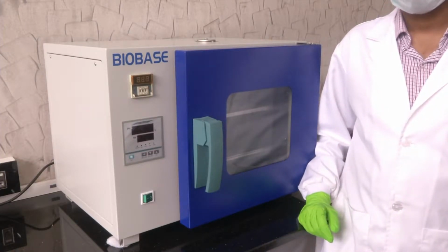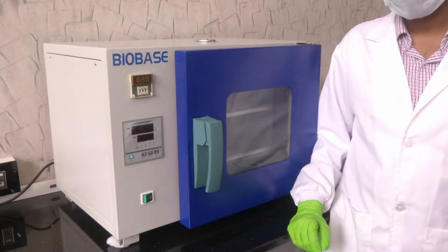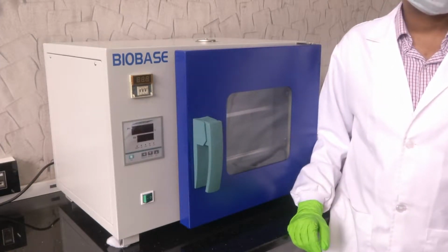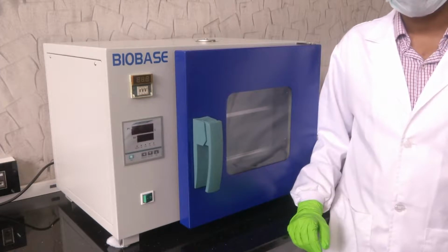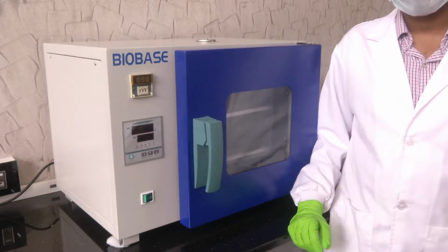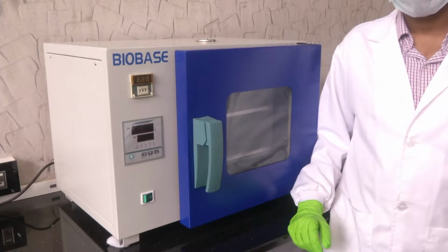Today we will see another important equipment that is used in a microfabrication lab. This is a standard oven. We have Suman Chatterjee here with us to run you through the different knobs and features available in the oven.